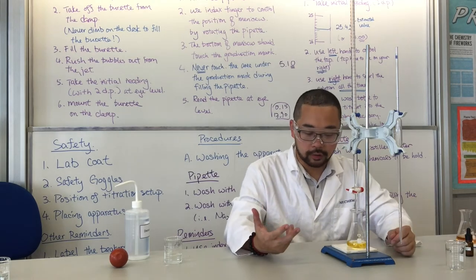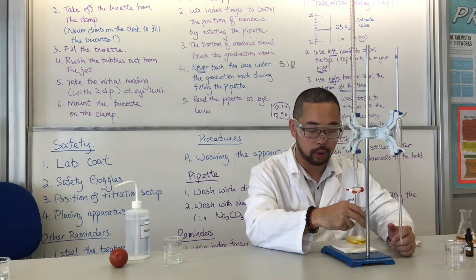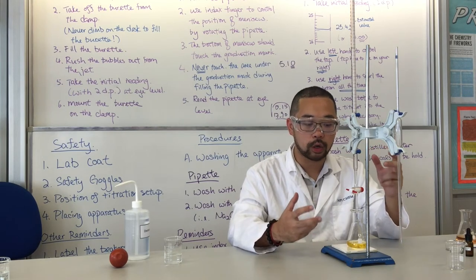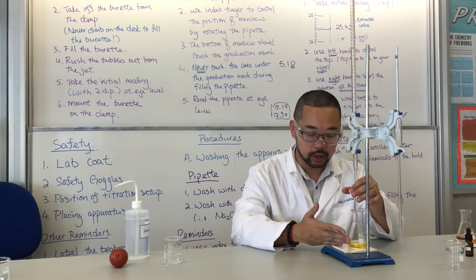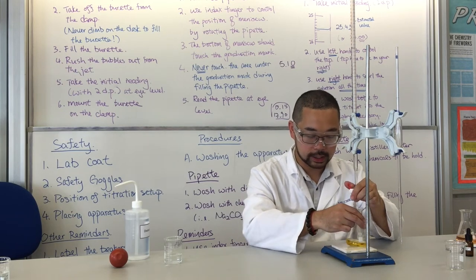What is the function of the right hand? Your right hand is used to swirl the solution, to mix the solution when you add the titrant into it. So both hands have to work together. When you add the solution into it, it's not only the left hand adding the solution while the right hand is resting right here. You should do it together like this.